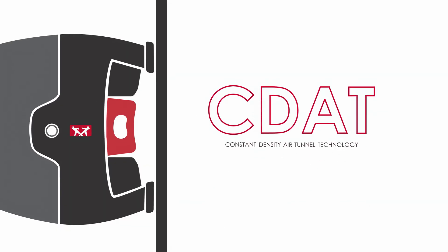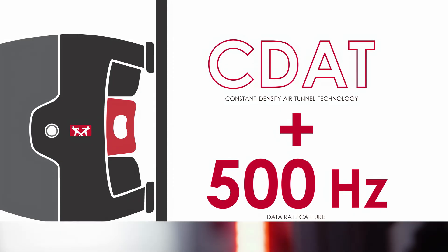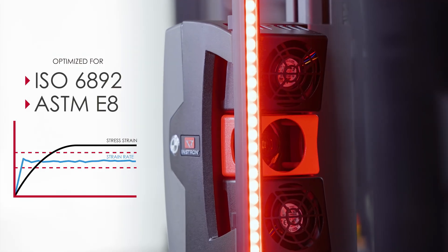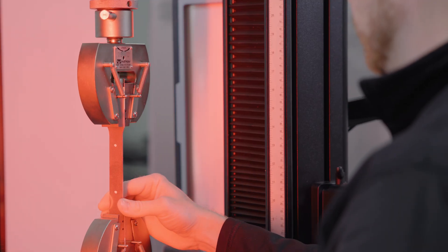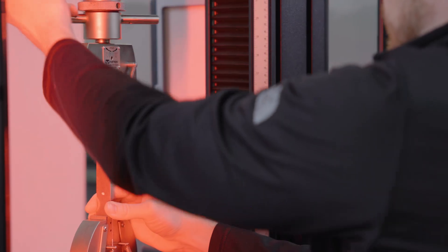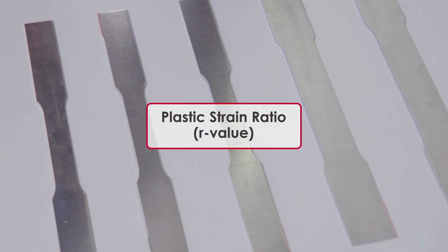This enhanced CDAT technology, combined with a data rate capture of 500 Hz, allows the AVE-3 to meet stringent strain control requirements, unlocking a critical capability in metals testing for video extensometry, providing real-time strain data for more accurate insights into material behavior.